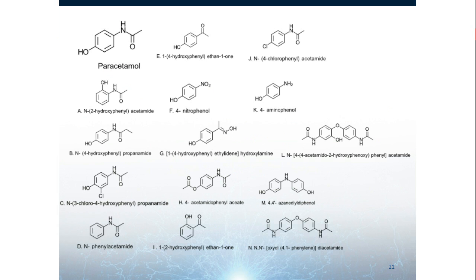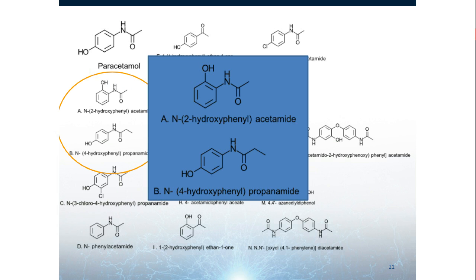So here I have the structures of all those compounds, and we were focusing in on compound A and compound B. So A, you can see, is less hydrophobic than the B compound, which is hydroxyphenylpropanamide. And this is the explanation for why the Halo C18 column is more retentive for this more hydrophobic compound compared to the Halo Phenylhexyl.